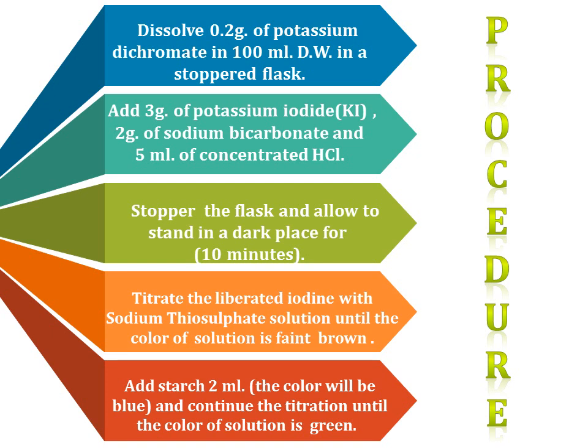But if we add starch when the solution is faint brown, meaning a low concentration of iodine close to the end point, a blue reversible soluble complex between the starch and iodine will form. So it is essential that starch is added when the color of solution is faint brown, meaning I have a low concentration of iodine.